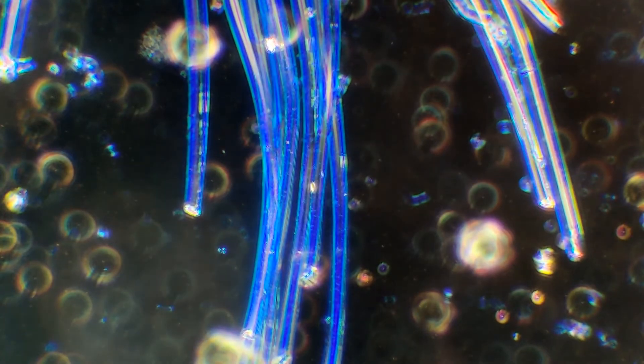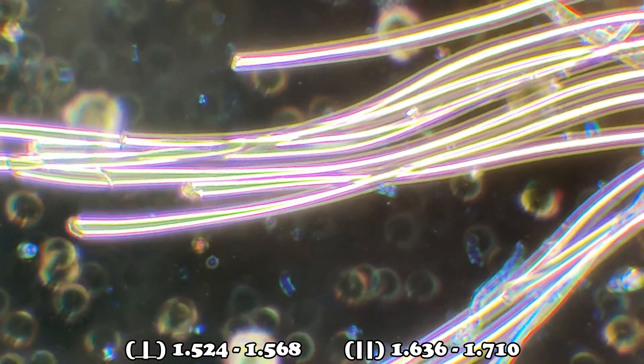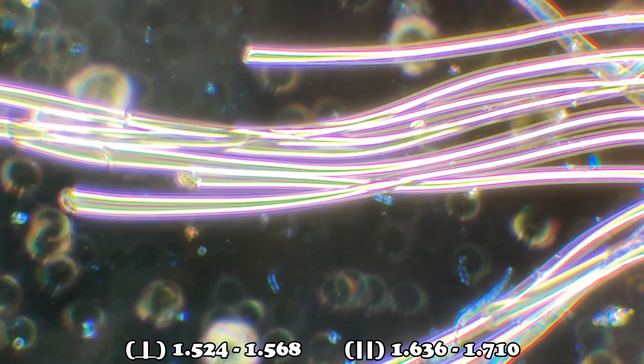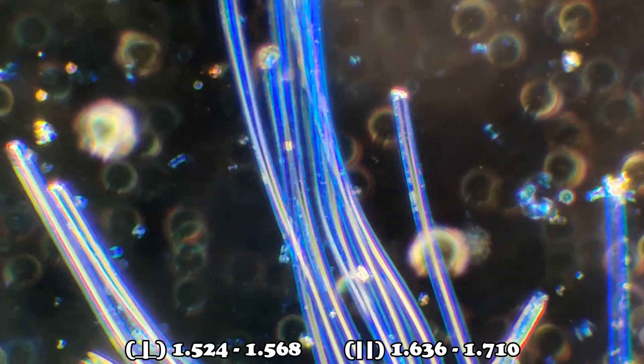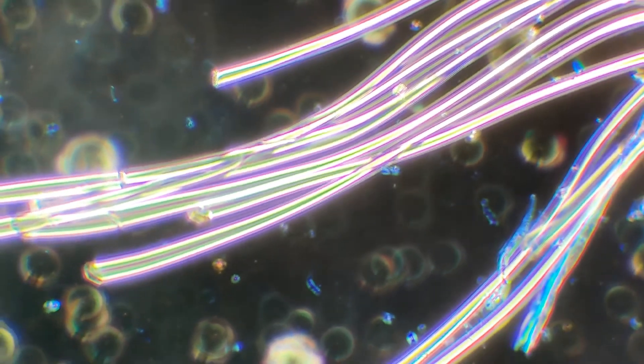Because of the refractive indices of polyester, in 1-5-5, the fiber will exhibit a blue color when parallel to the polarizer, or the vertical orientation, and a bright whitish-yellow color when perpendicular.